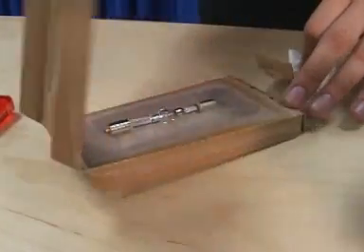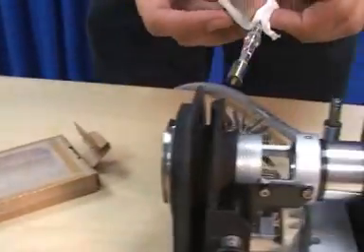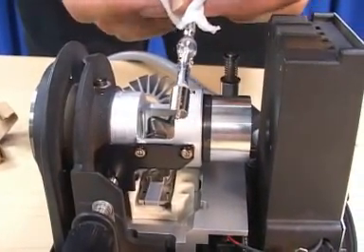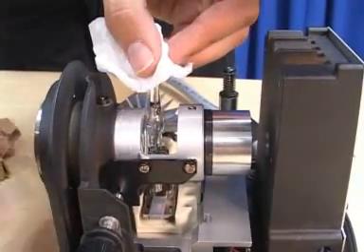Do not touch the glass part of the burner. You should use gloves or a piece of lens tissue to touch the bulb. If you accidentally do touch the glass, wipe off your fingerprints. Grease from your fingers will compromise the glass and dramatically reduce the bulb life.